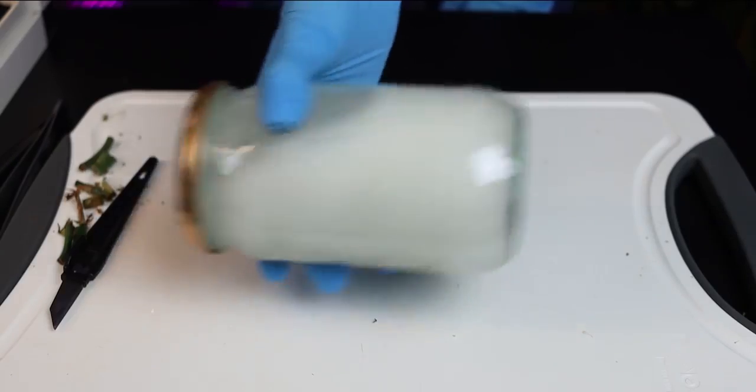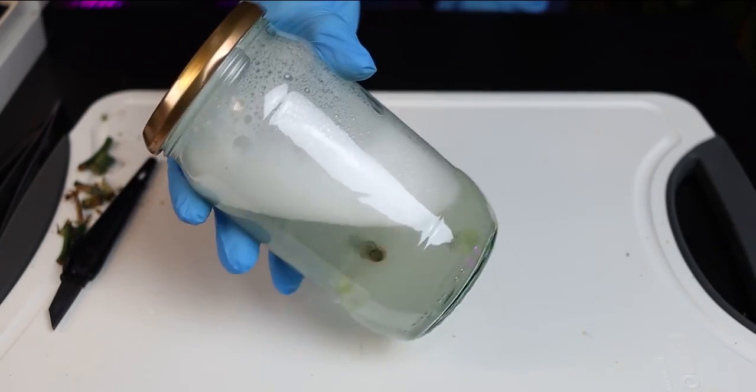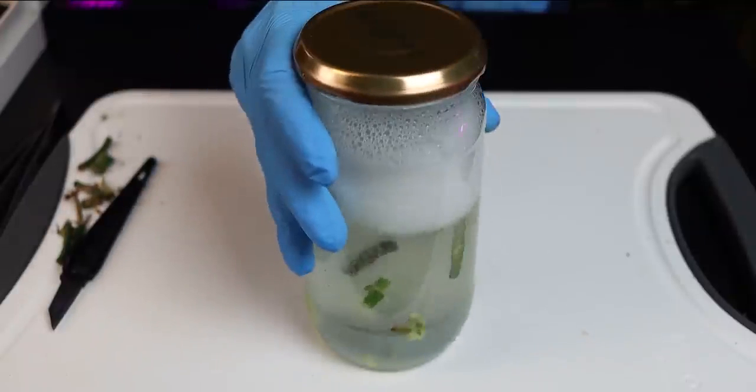I'm going to leave this to soak for around about 15 minutes or so, and I'm going to agitate it every few minutes just to make sure everything is nice and clean.